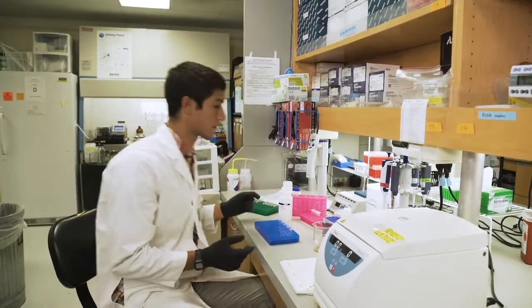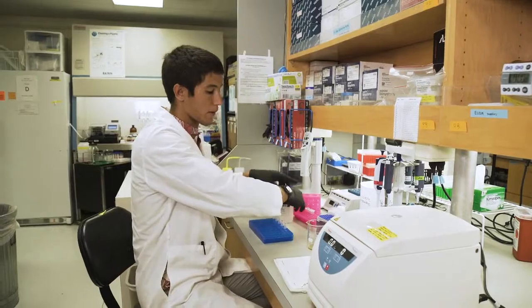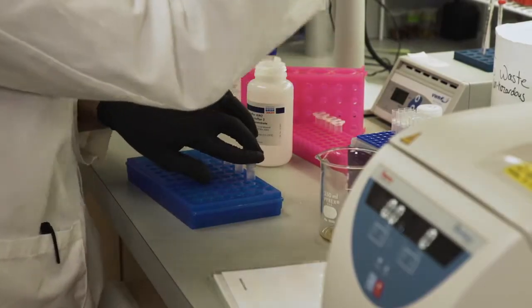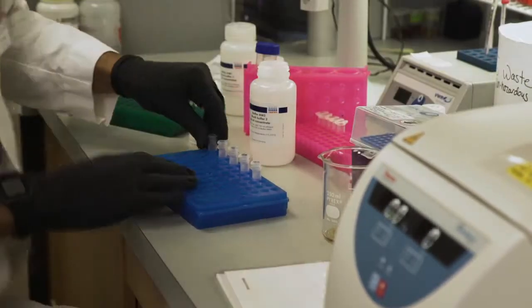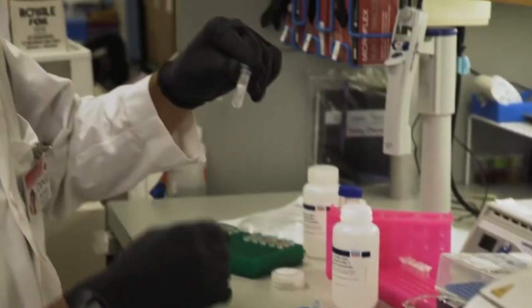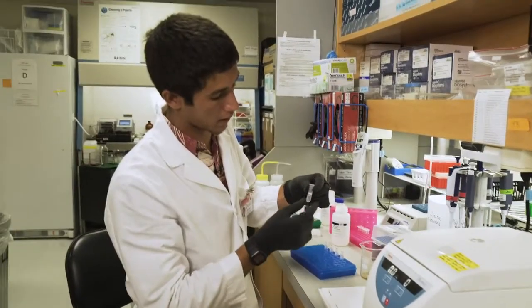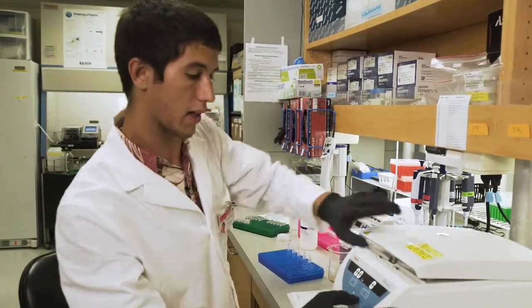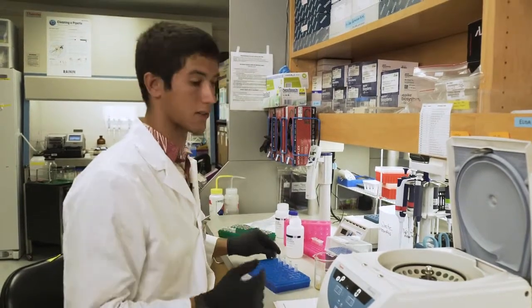All right, and this is going to look like a repeat of the last step because it mainly is. It's just with a different wash buffer. So, all right, our second wash buffer has been added. For the second wash buffer, because it's dealing with smaller stuff, it's better to let it sit for just a little bit. So we're going to go ahead and load it into the centrifuge, but we'll give it a minute or two before we actually start spinning it.